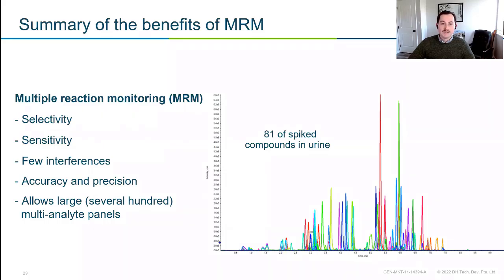I talked about having the chromatographic resolution, which is really important. You saw that with the matrix interference. But because an MRM experiment is so selective, it's okay if you have overlapping peaks because they're looking for completely different things. So that allows you to have these really large panels. So here's an example of a medium panel of 81 compounds. You can see that we have some peaks superimposed, but they're looking at completely different experiments. So we're not worried about it.